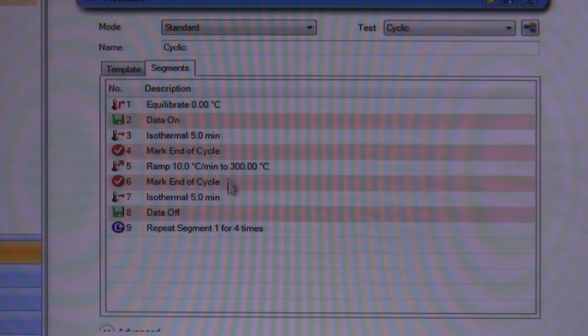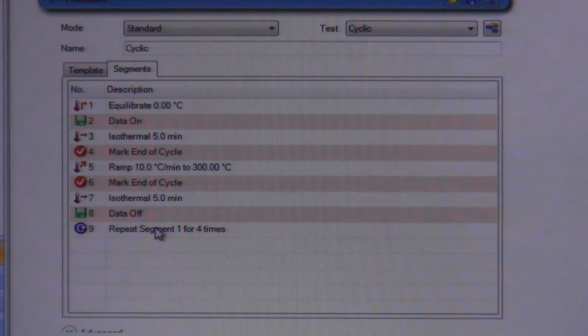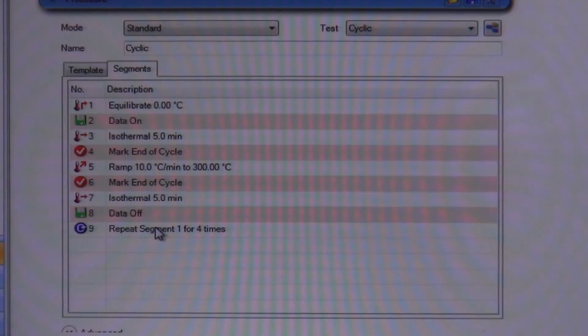And that's also why it doesn't record that cooling step because there really isn't a lot to see in there in terms of doing a proper analysis. Typically when you do a proper analysis, you want to control your heating or cooling rate so that you can actually know what's happening physically and the math works out and all these other things are easier.